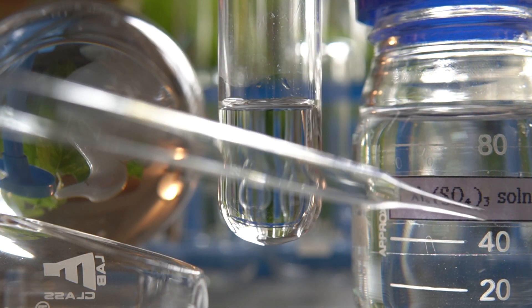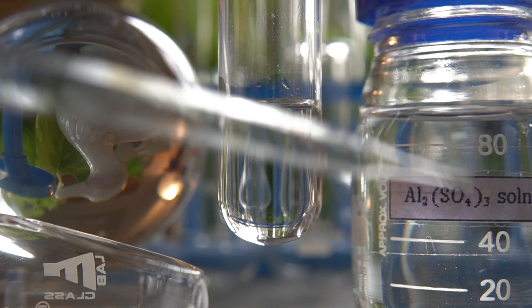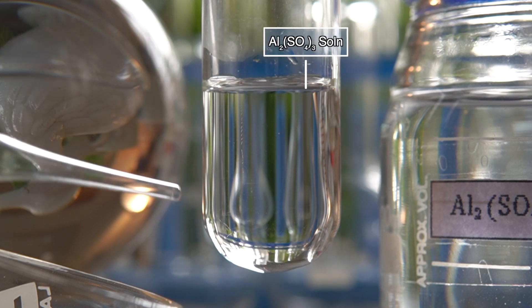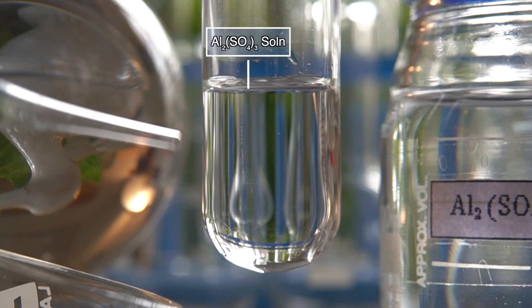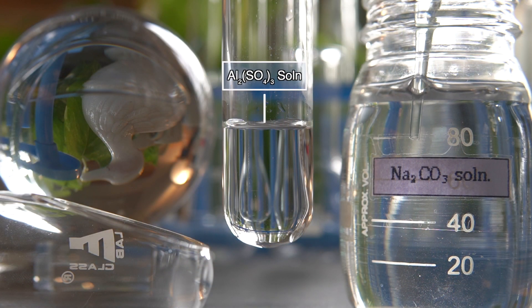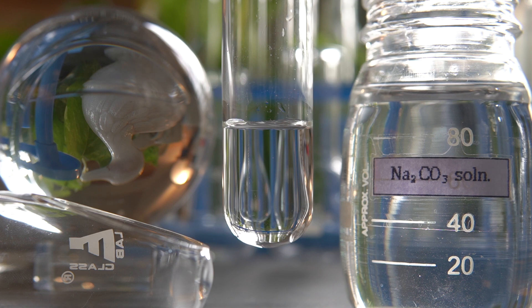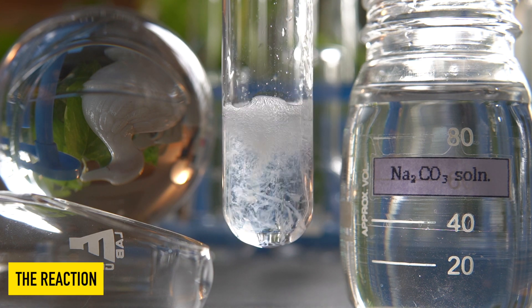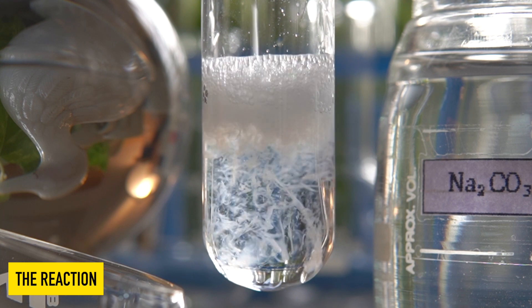Now to initiate the chemical reaction, we will take some clear solution of aluminum sulfate into this test tube. Now we will add the clear solution of sodium carbonate dropwise onto the aluminum sulfate solution and observe the effects.